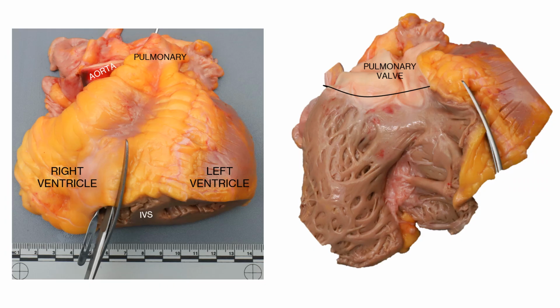Getting into our next cut, again, we are back onto the anterior surface. We have our right ventricle here. You see my probe, again, right ventricle into the pulmonary. Why I highlight the septum here is that you do not want to cut through the septum. You want to cut essentially parallel with the septum. So anterior, parallel with the septum from the right ventricle into the pulmonary.